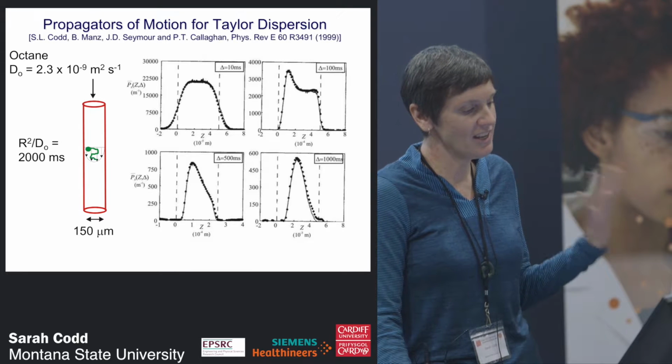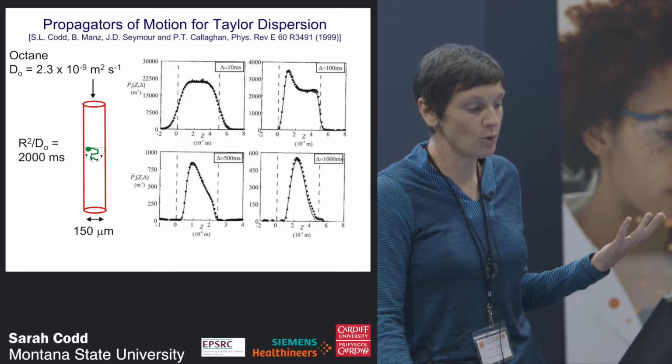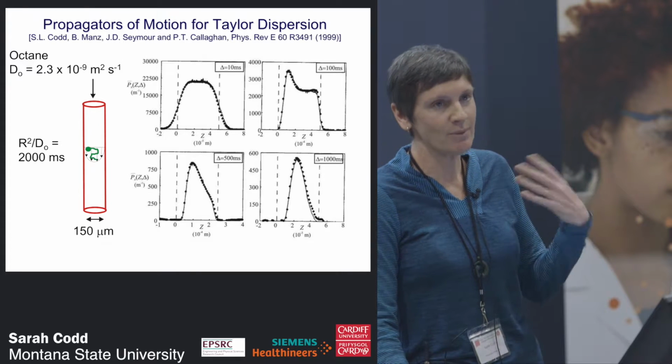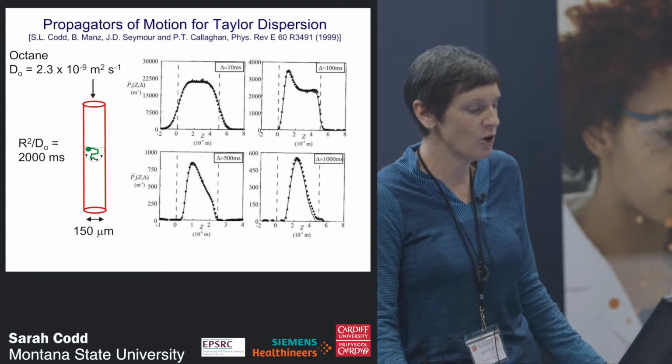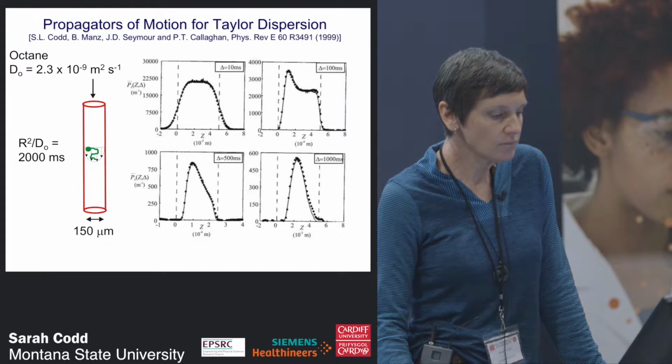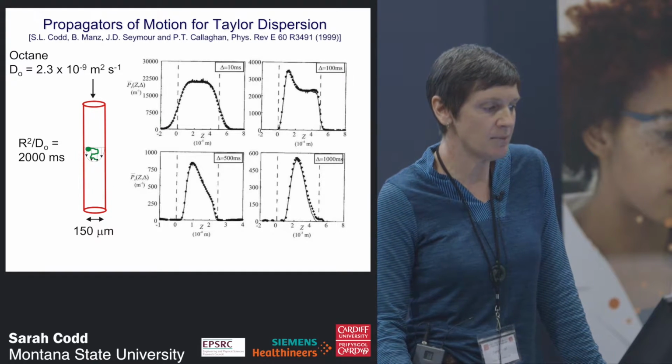We tried to flow with water, but then we would get small bubbles forming in the water at the end of the capillary, and they would completely halt the flow. And so we ended up using octane in the end and just a 2 centimeter pressure head to make this flow. So anyway, some simulations by Bertram Manz.